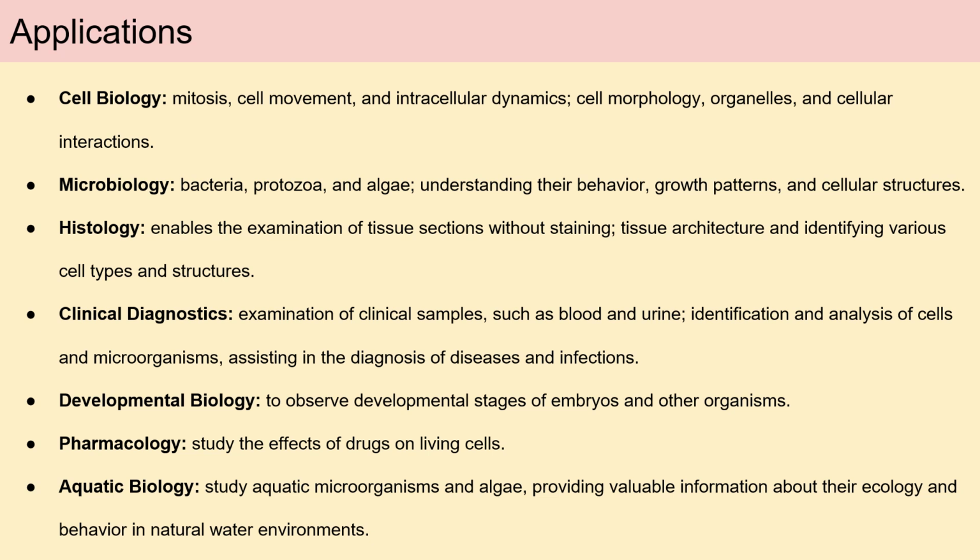Lastly, in aquatic biology, phase contrast microscopy is employed to study microorganisms and algae in natural water environments, contributing to the understanding of their ecology and behavior. Overall, phase contrast microscopy provides high contrast visualization of transparent and colorless specimens, making it an invaluable tool in both research and clinical settings. Thank you.